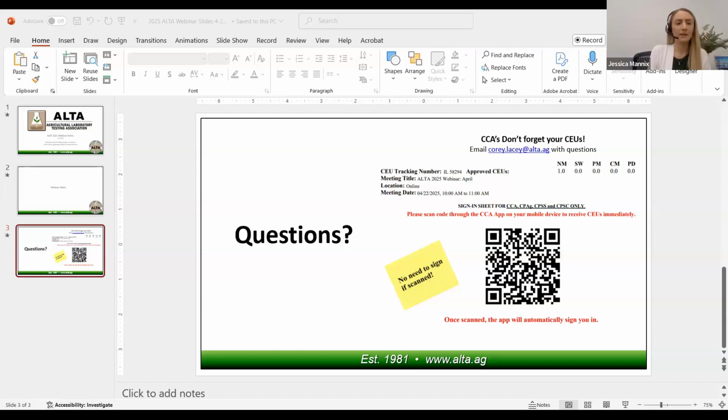Yeah, absolutely. Depending on if you're using a micro or macro analyzer, you might have an easier transition. When we're looking at a larger sample size, we're able to produce a larger signal area to the detector, which is the culprit. When we're working with a thermal conductivity detector, we're using the carrier gas as the reference side of the cell. What we're doing is extrapolating the difference between the reference gas thermal conductivity and the sample gas thermal conductivity. Explicitly, when we compare the thermal conductivity of nitrogen to helium versus nitrogen to argon, we have a bigger difference with helium. This bigger difference allows the detector to see nitrogen at a lower concentration level, which enables better precision on the lower end.